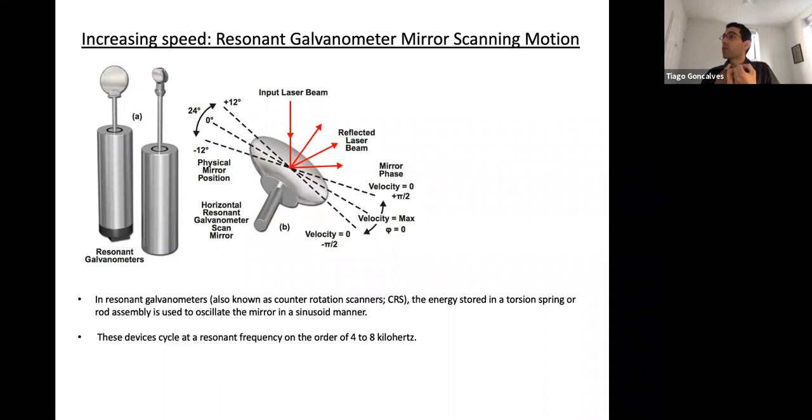So everything will look a little bit like an underexposed photograph, like a photograph you took in a club at night and your phone didn't do a very good job. That's why, when you have these night shot modes on your phone, what happens is that your phone is averaging a lot of frames and going slower. And this is what you need to do very often with this kind of imaging.